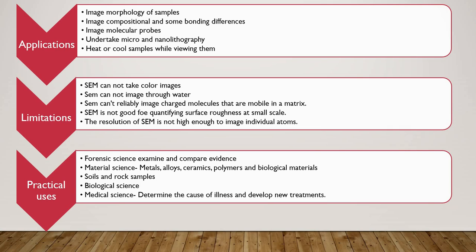Next is study optoelectronic behavior of semiconductors using cathodoluminescence. So these are the applications of SEM. Then limitations. SEM cannot take color images. The color is often added artificially in colored SEM images.